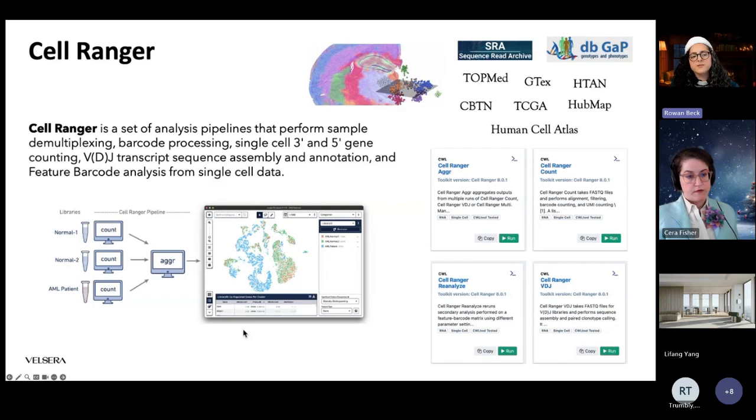I don't know if Sarah, you have any experience using Cell Ranger. Yeah, I've played around with this. I've only used it with the public data sets that 10x Genomics puts out on their website. For a long time, single cell sequencing has felt like a mysterious country to me, because I came of age when we were all very excited about bulk RNA sequencing.